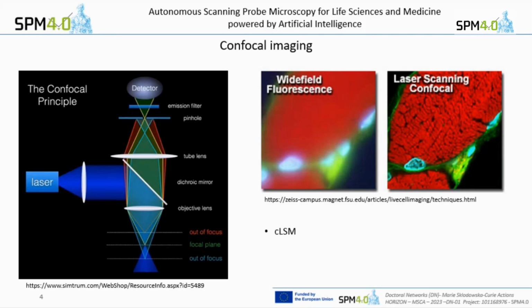Scanning because you just illuminate a very small pixel of your sample, and then you have to move the laser around, usually in a line pattern. And since you're only imaging in a very small focal region, you can then shift the imaging region up or down and do multiple slice imaging. With that you can get 3D images. And as I said, it's usually dependent on stains, but you can also do reflection imaging with that, which is also cool for certain samples.